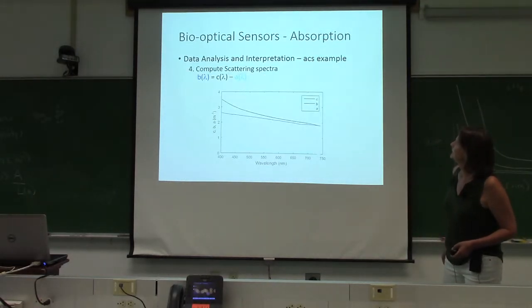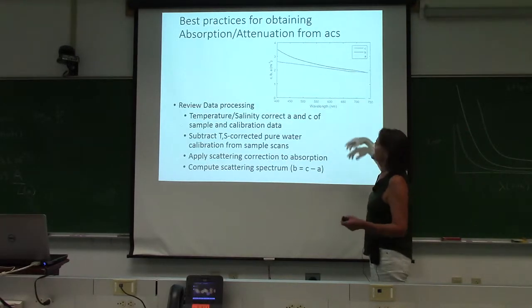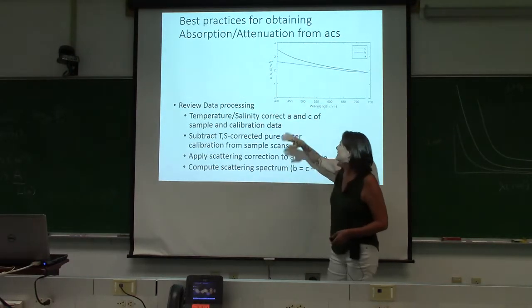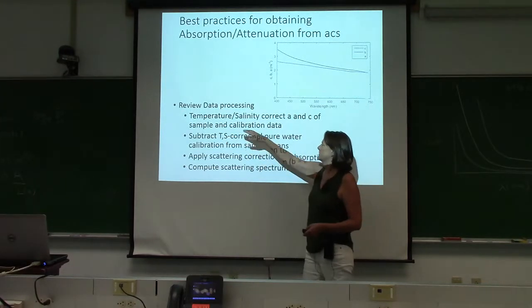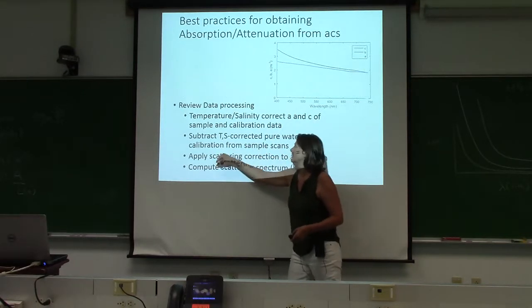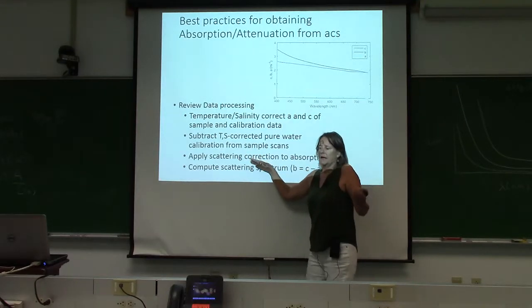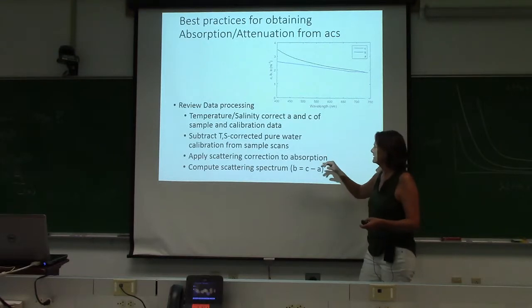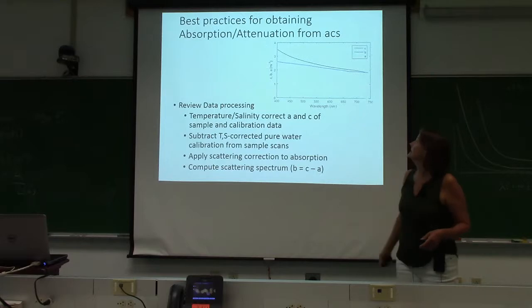Good. Okay. Yep, so you would compute your scattering if you've done your corrections. So, steps: calibrate, temperature and salinity correct both sides of your sample and your calibration water. Subtract your temperature and salinity corrected pure water calibration from your temperature salinity corrected sample. Do something with scattering. You should try a bunch of different ways to correct for scattering, see what the difference is between them, and then you'll compute your scattering spectrum. And those are the steps for the AC meters.